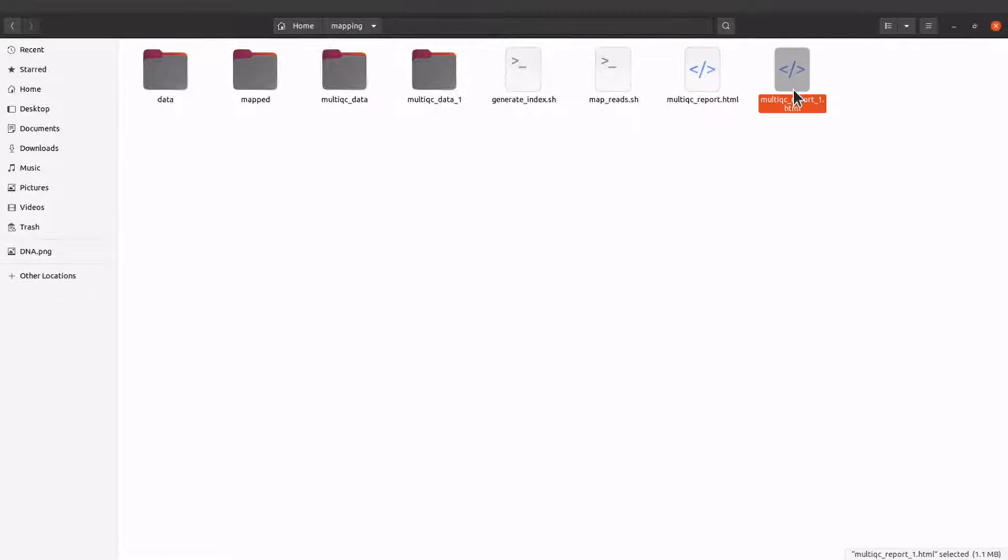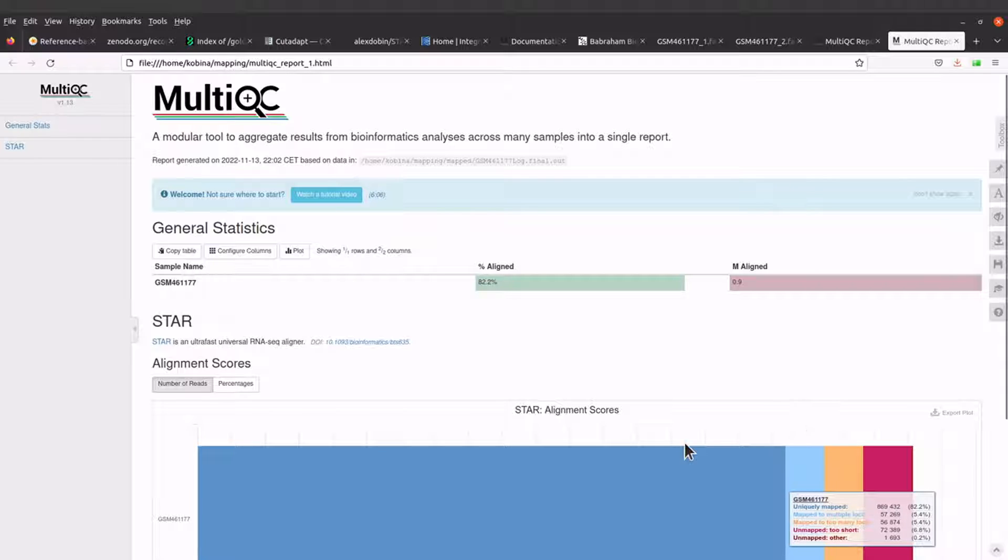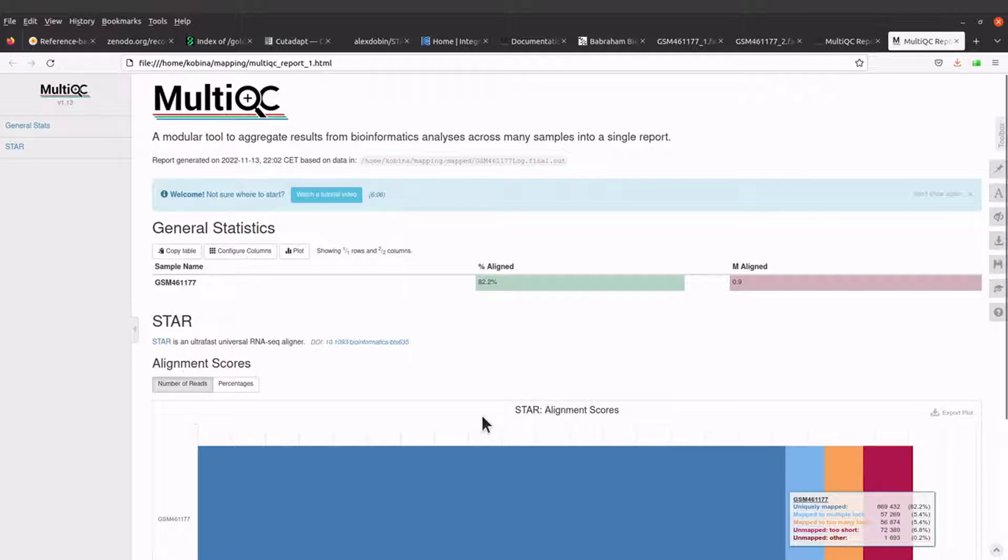So this is the MultiQC report for the STAR mapping activity. Let's open it with our browser. Okay, so it has been opened.